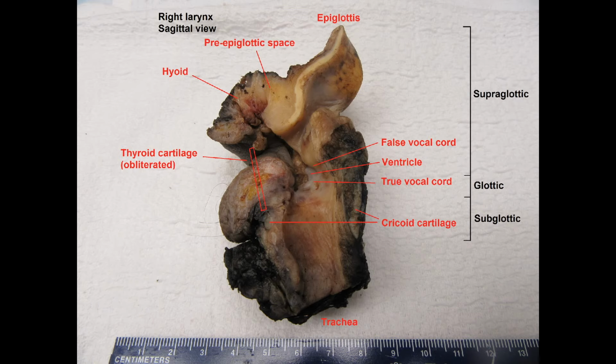Yeah. So the uninvolved larynx, again, depends on where the tumor is located, in part. For a supraglottic tumor, it is very nice to get a section of hyoid bone, even though most of the time the hyoid bone is not involved. If the hyoid bone is freely movable, then I suppose I don't really need a section, unless it appears to me that it's heading toward the direction of the hyoid somehow. But I'm not sure how I would tell that on the scope.